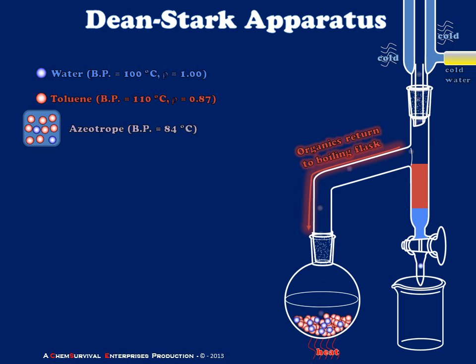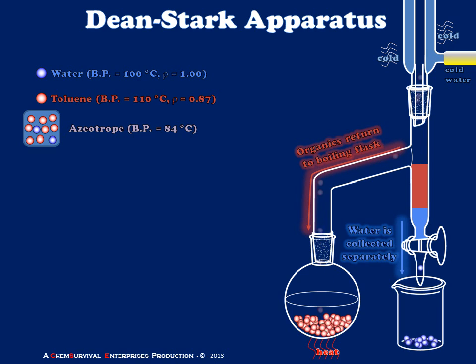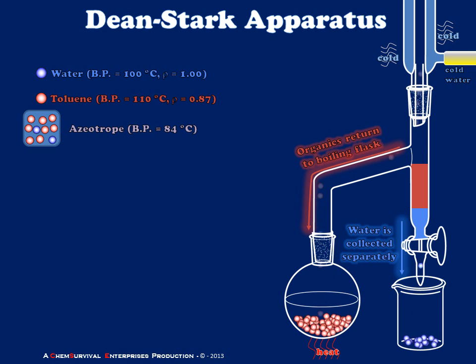When we do this, we can see how the Dean-Stark apparatus truly works — it's directing the flow of water into a separate zone from that of the toluene. So at the end of my run, I can expect to have dry toluene in the boiling flask and pure water collecting in my receiving flask or beaker. And this is the principle on which the Dean-Stark apparatus works.